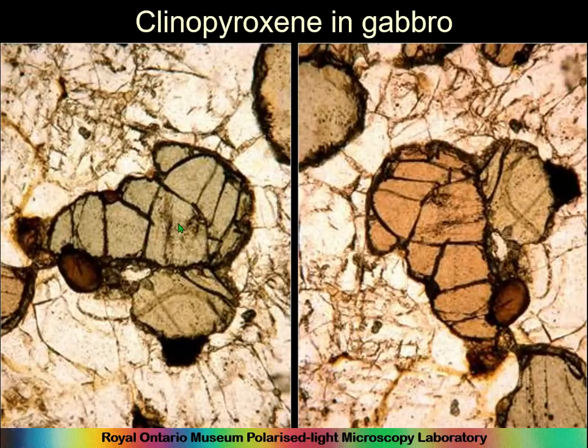And here it's a bit less obvious, but basically you're looking at this high relief mineral. You can see it's sort of looking like it's sticking up, with cracks that are more or less going in the same direction. Okay, so this is something you'll see, especially in pottery, where you have smaller inclusions than you might in a rock with bigger inclusions.